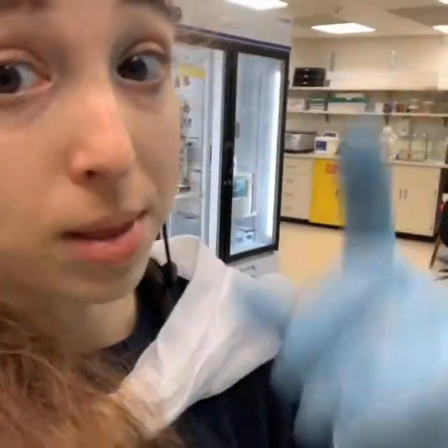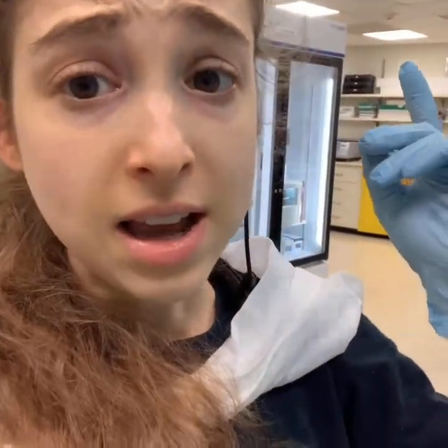And that's good for keeping things that flow through when you don't think your protein should be in it, like during a wash step. So you don't want to collect all these little fractions because your protein shouldn't be there. But in case it is there you don't want it to just go out into the waste. So that's the waste. If you're in a lab, make sure you empty the waste because people don't empty the waste and then it overflows. And then there's just a wet mess you have to clean up. So don't be that person.